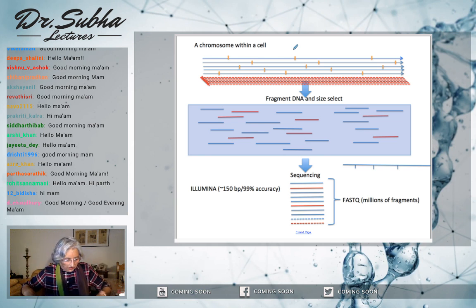So one of the techniques for fragmenting, I think, is just heating it up. Because of that, different DNA molecules break at different points. If you make an enzymatic cut, then all of them will be cutting at exactly the same place. You're not going to do the enzymatic cut. You're doing just heating, so they randomly shear here and there, which is good.